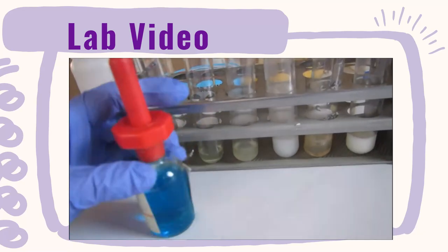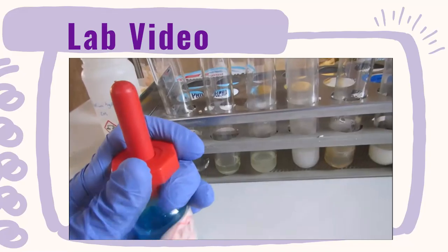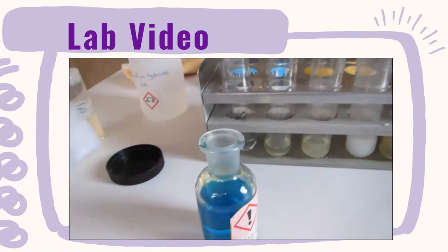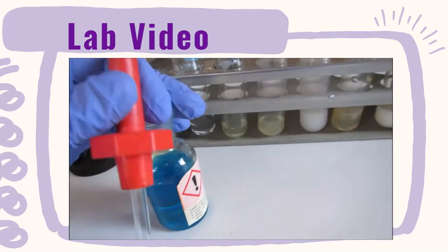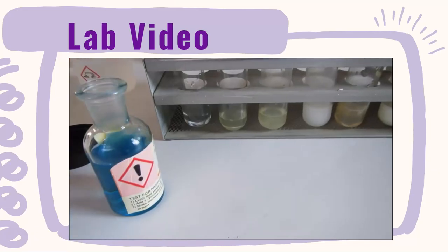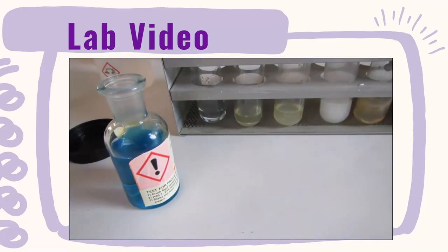So I've added my sodium hydroxide to all of them. I'm now going to take my biuret reagent, which is a lovely blue colour, and again add it to all of the tubes.